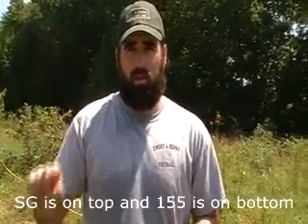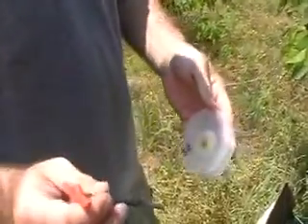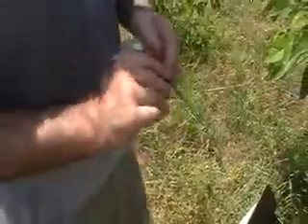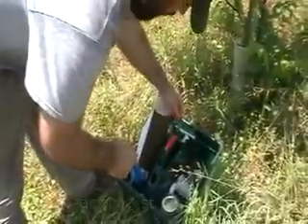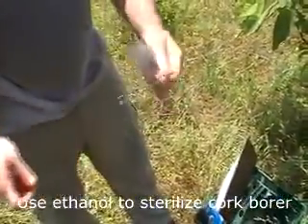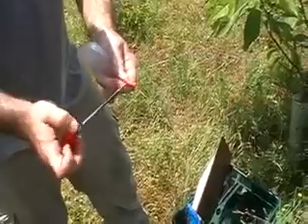We always put the SG up high and then the 155 goes down low. Before we make our inoculations we need to punch holes in the plate. So first I need to sterilize the cork borer. I'm shaking it to get the ethanol out of the inside of the tube.